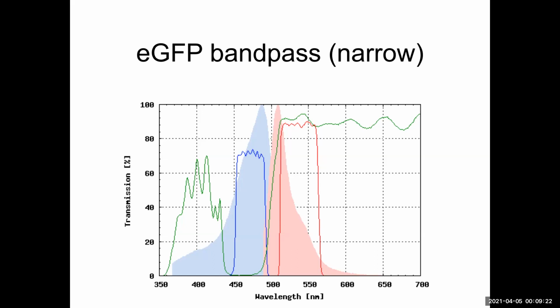So hopefully we're good at patterns. You're starting to decode the pattern here. There's the light that the fluorophore wants. Oh, we're going to put the excitation filter right there. The light that it's creating that you want to see, that's your signal. Oh, we're going to put the emission filter there.